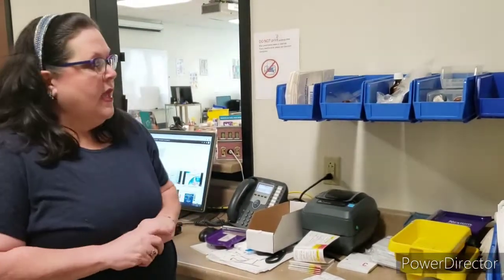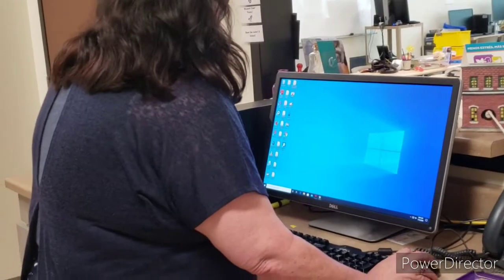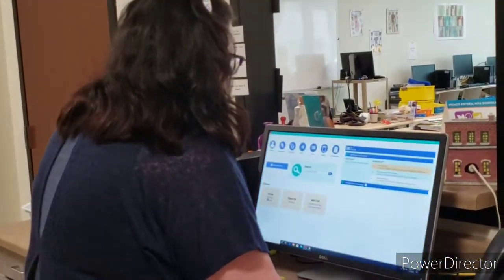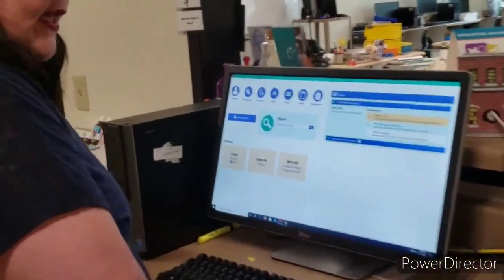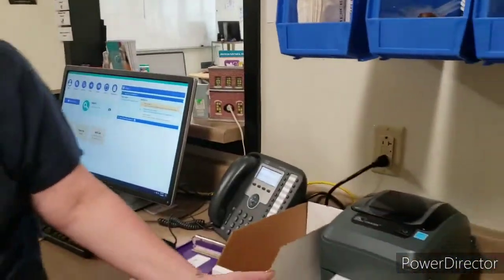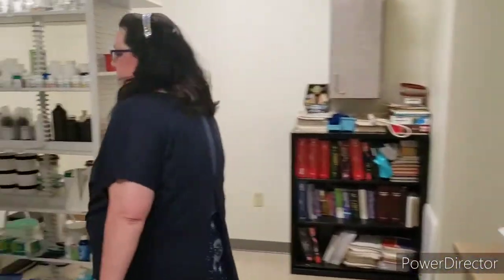So as you're putting in prescriptions and trying to locate them, it could be either brand or generic. Everybody will be given a different set of prescriptions. We'll just use this one. There'll be a separate tutorial for this software, but you'll come over and put your prescription in. When you have your prescription in the computer, you'll print out your labels here, and then we'll actually go find our drug. So remember, A starts over there, Z ends up over here.